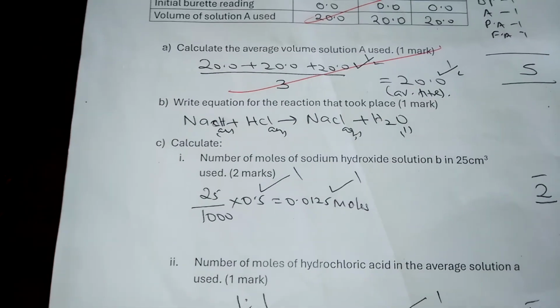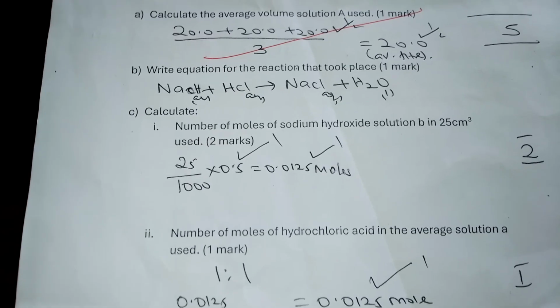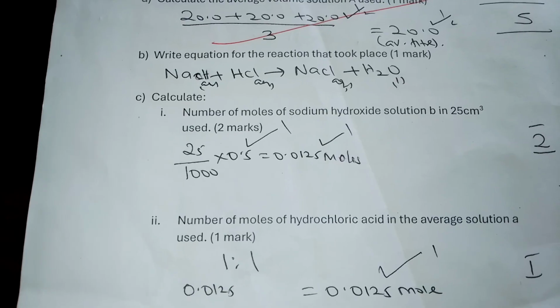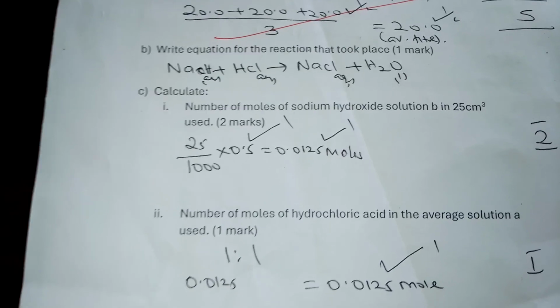So that is what we did, and then we went on to answer question C, Roman 2, the number of moles of hydrochloric acid in the average solution used.